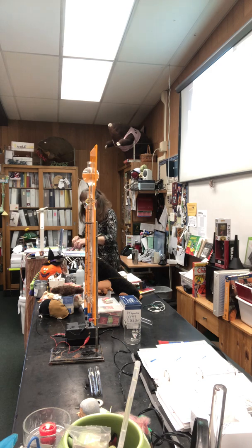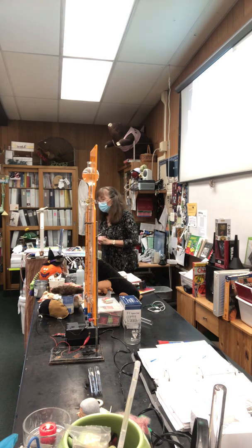We're going to do something called the splint test to see which gas forms. There are two types of splints: glowing splints and lit splints. And I will show you both of those when we are ready to test the gases.